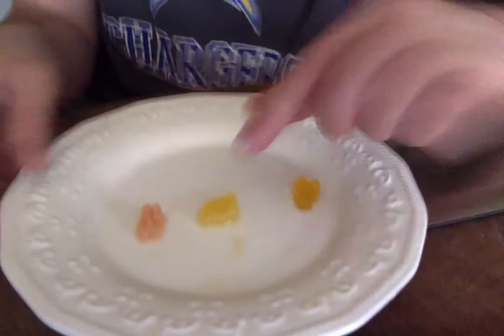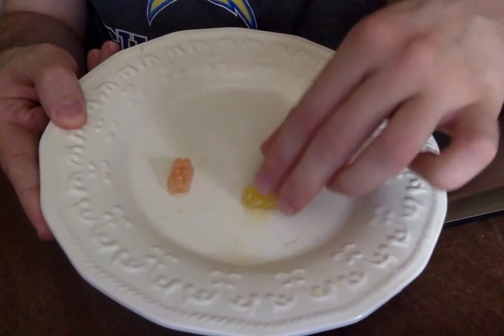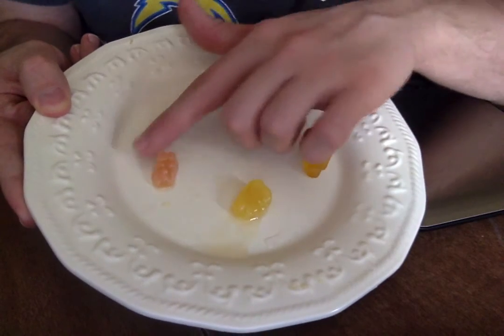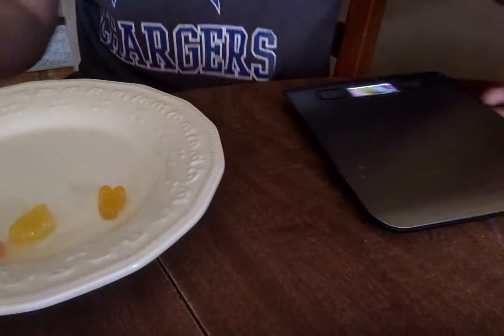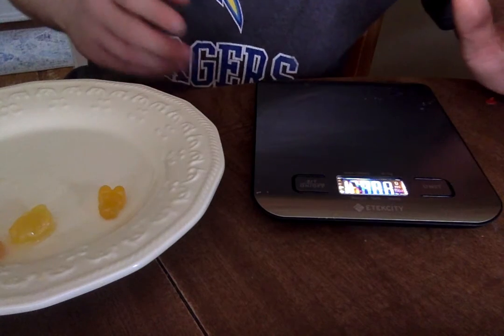So I'm going to show you guys that right now. So this one here, as you can see, it's pretty swelled up. This is the one that was in the water solution. This one that looks shrunken, the orange one here, this is the one I placed into the salt solution. And then this one is our control. So I'm actually going to weigh these for you guys now, just so you can kind of see what we've got.